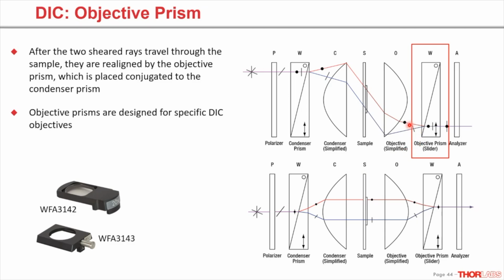As you can see in this image, the E and the O beams are delayed from one another. They pass through the opposite birefringent effect as the first prism, because now they're passing through the bottom part, and they will emerge linear and in phase. The same will happen through the center of the condenser prism. And so the light emerging out of this second Wollaston prism will be linear if there's no effect from the sample.